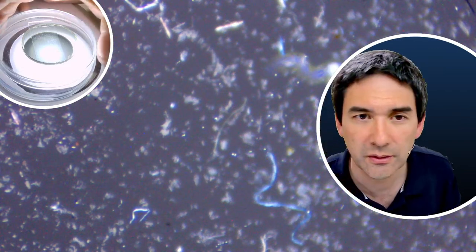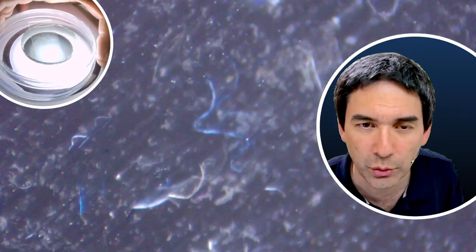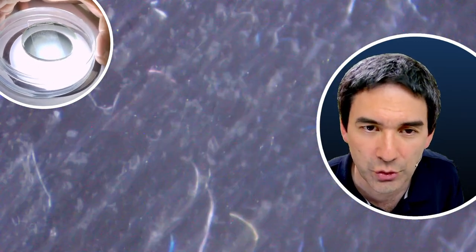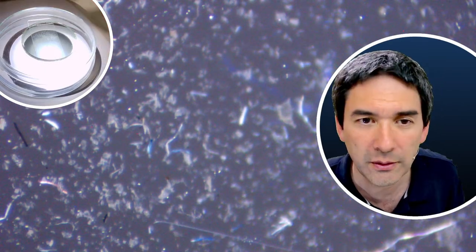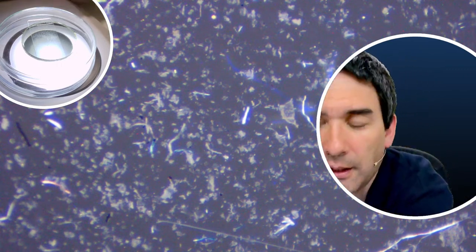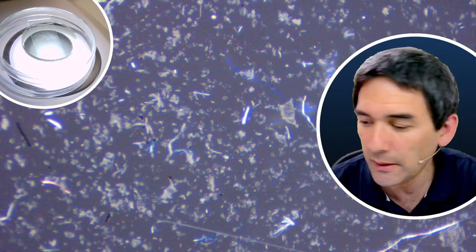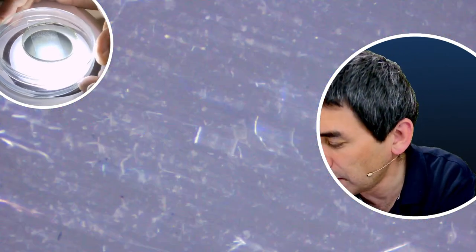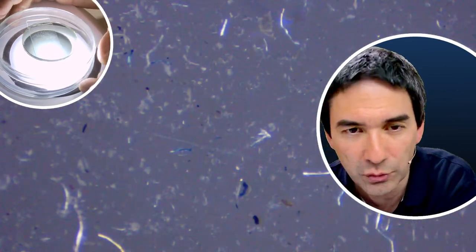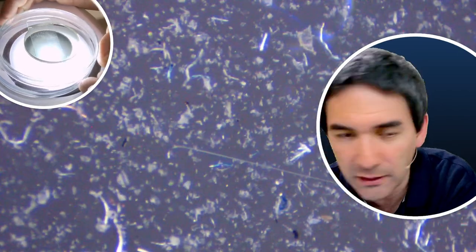So again, I think I have now some kind of new motivation to figure out a better camera solution for this microscope here. Now that I also have it standing next to my other microscope, I'm not quite as happy. And it's not the camera alone which is the problem, but it keeps on readjusting the exposure, so I have to go manual. And if I go manual, however, then I have to keep on readjusting the exposure when I change the magnification.